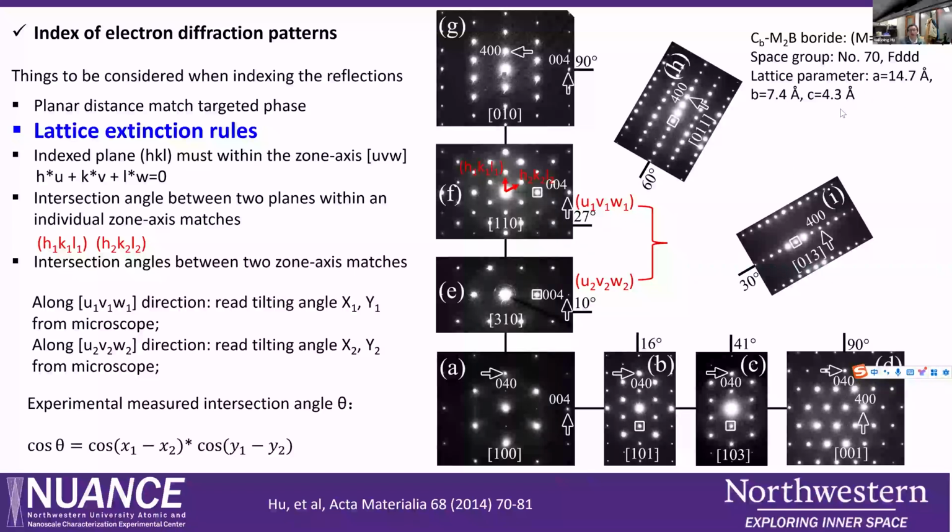Of course, for your own project, before you do the diffraction, you may already know what phase you have. So you don't need to do so many things as I do with this large tilting. But if it is an unknown phase, you have to do it like this. Okay, so today I will focus on the lattice extinction rule. This is very important, and it's very easy to ignore, so I want you to pay attention to this one.